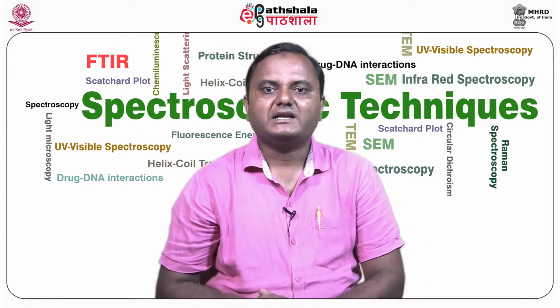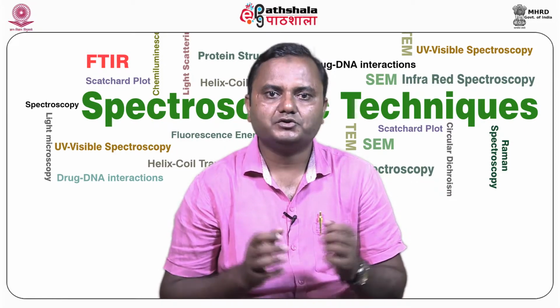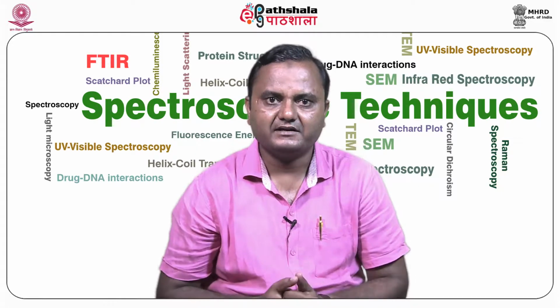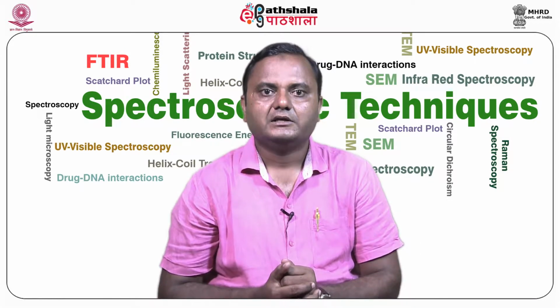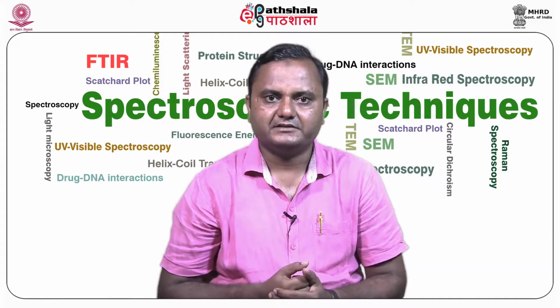Now, we will talk about light scattering and Mie theory. It is the complete solution of the Maxwell equations for a homogeneous sphere, where incident light of only a single wavelength is considered. No dynamic scattering effects are considered.